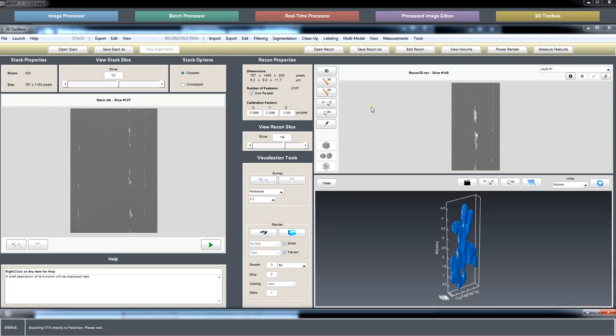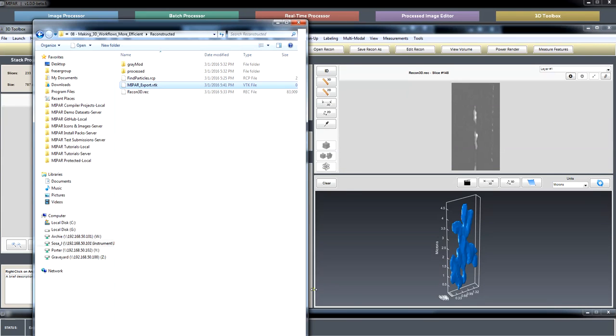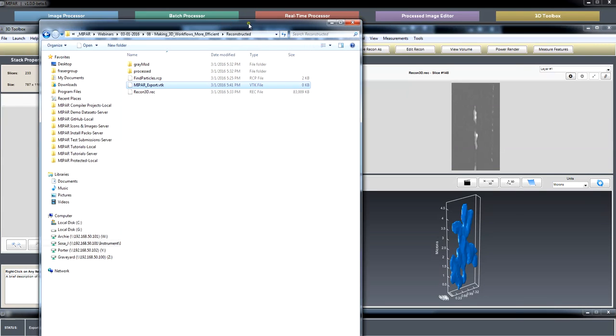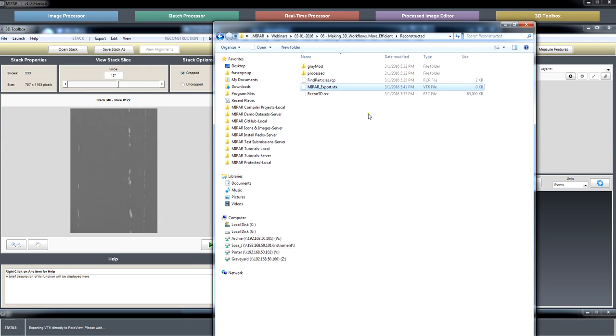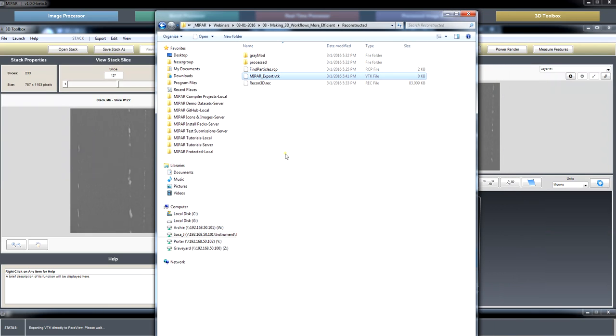Yes, definitely. Let me check on where this is going to. I think this is coming into this folder here. Yeah, so we're up to... Unfortunately, some of these processes are not cancelable. We'll give it a few more seconds and see if it plays nicely.